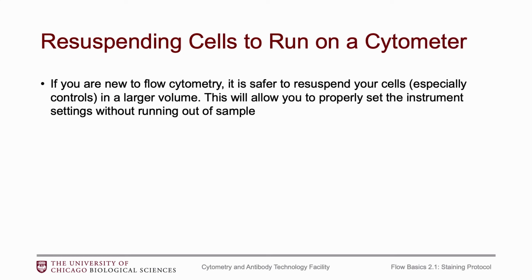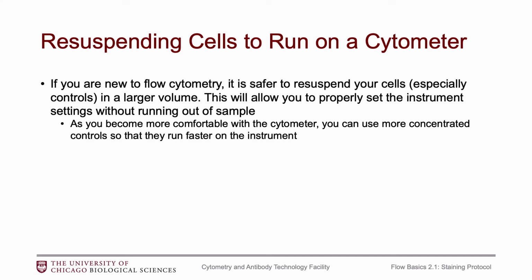So that's another question I get a lot, is what volume do I resuspend my cells in? It really depends on the cytometer and also how comfortable you feel running it. So if you're newer, then it is safer to resuspend your cells in a slightly larger volume so that you have enough time to set up the instrument before you run out of sample. And as you become more comfortable, then you can certainly decrease the volume just so things run a bit faster.